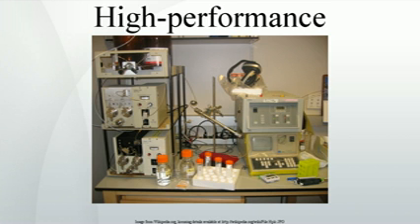Size exclusion chromatography. Size exclusion chromatography, SEC, also known as gel permeation chromatography or gel filtration chromatography, separates particles on the basis of molecular size, actually by a particle's Stokes radius. It is generally a low-resolution chromatography, and thus it is often reserved for the final, polishing step of the purification. It is also useful for determining the tertiary structure and quaternary structure of purified proteins. SEC is used primarily for the analysis of large molecules such as proteins or polymers.